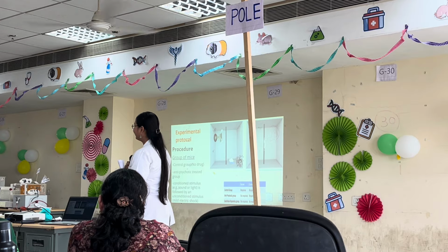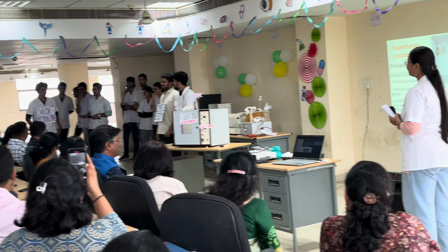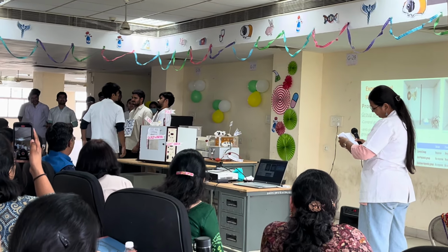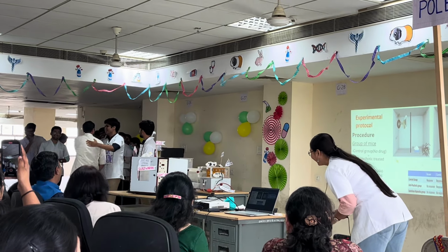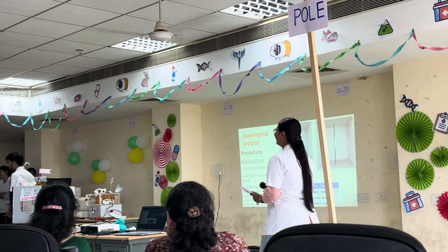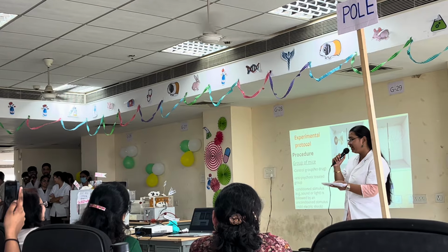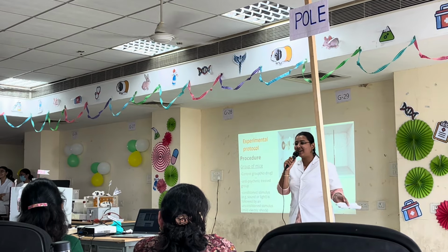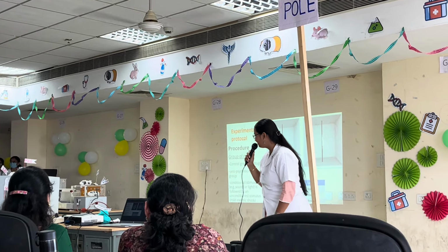So like this we saw, the drug had inhibiting actions on the higher centers of the brain, but it did not affect the limbic system. So the mouse did climb the pole. The conclusion will be provided by my friend Lee.